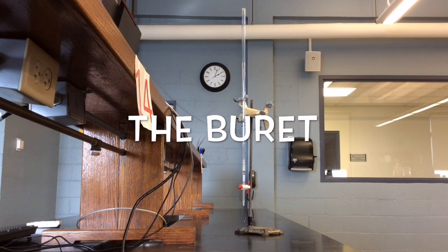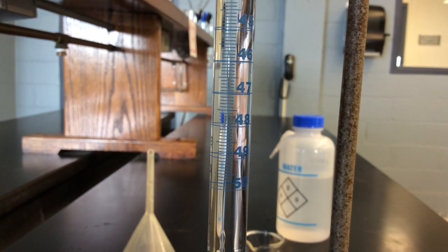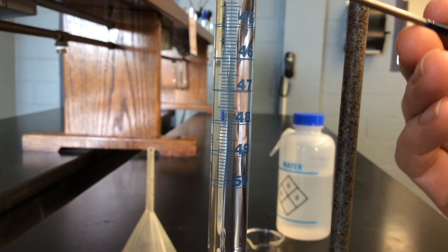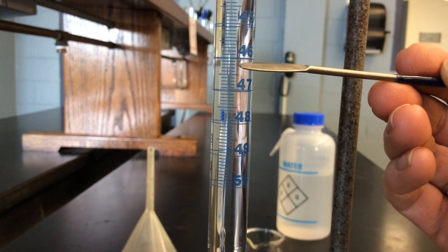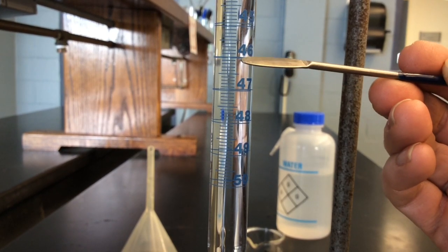The final piece of glassware I'd like to discuss is the burette. The burette is one of the most accurate and precise pieces of glassware we have in the lab. The burette has a precision of 0.01 milliliters, and it has graduation markings every tenth of a milliliter. It can be a little confusing to read a burette because the volume is read going down.